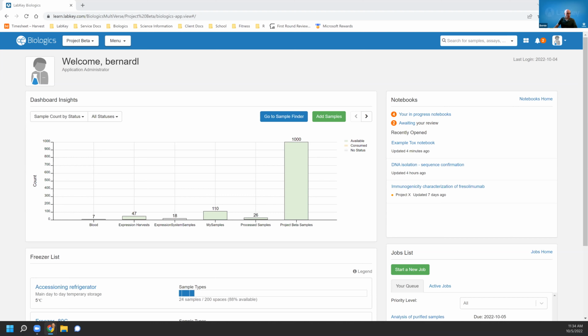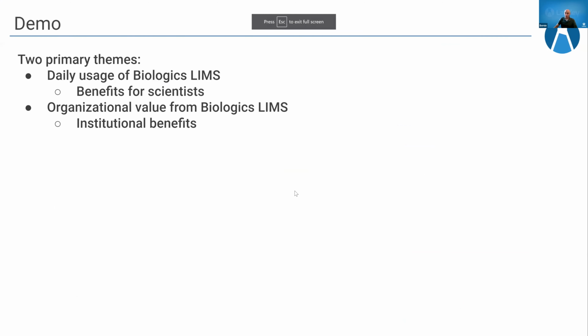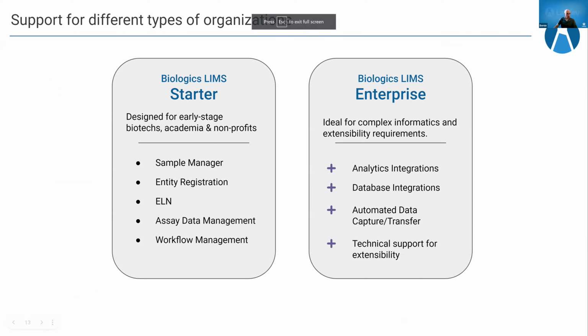I'm going to jump back over here and conclude by saying that what I showed in the application today is exclusively some of its built-in features. Adam, of course, talked deeply about extensibility, and major extensibility is possible.